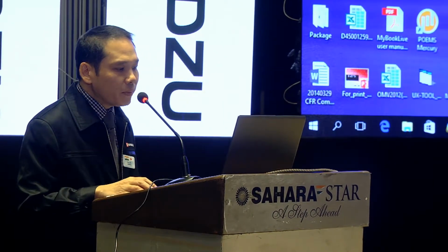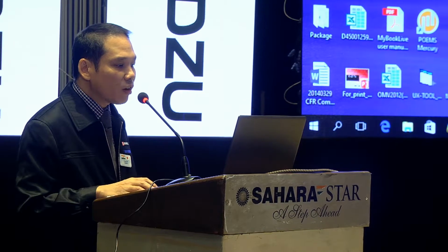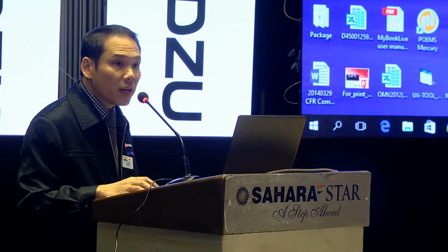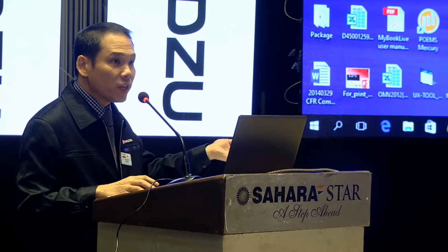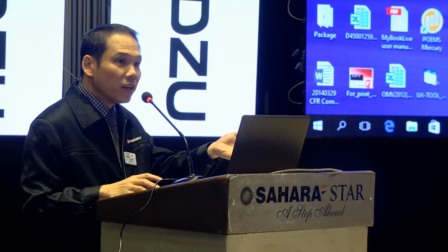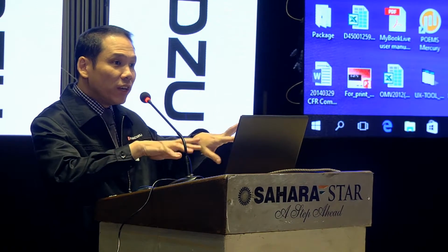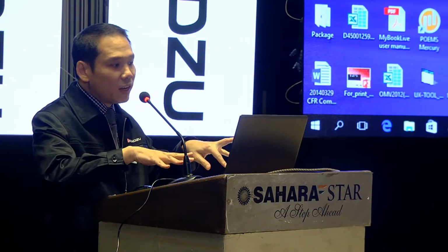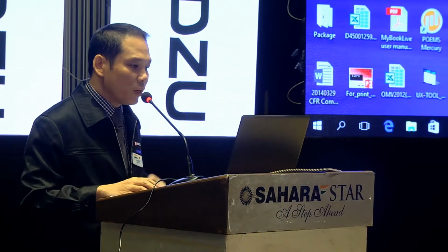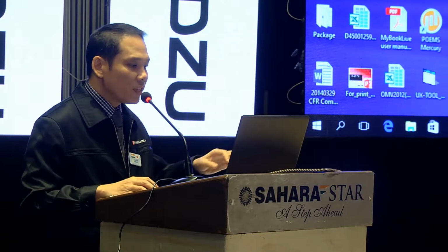So every time a new user first logs in, it is required to change the existing password, because the password was created by the administrator, right? So the administrator can log in using his ID. So now Sanjay has to create his own password when he logs in the very first time.